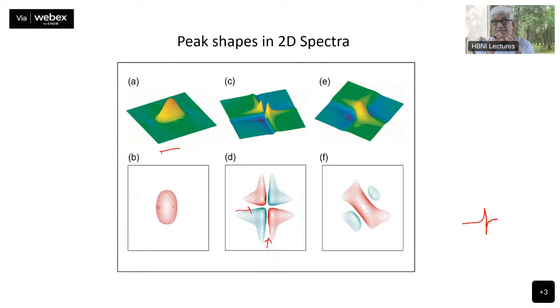These lead to what are called mixed phases, and that leads to very complex spectra. It can lead to a lot of loss of resolution in your spectra, and we should try to avoid this. As much as possible, one would like to get this kind of peaks, and it will improve the resolution in your spectrum. Clear identification can be made if you have line shapes of this type.